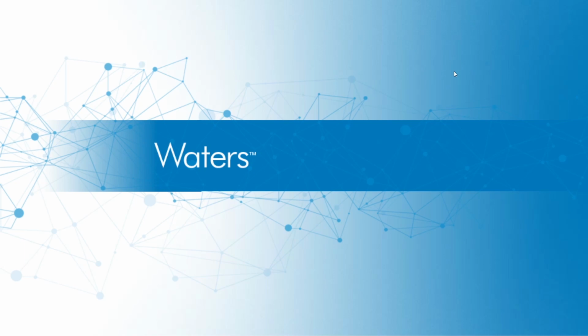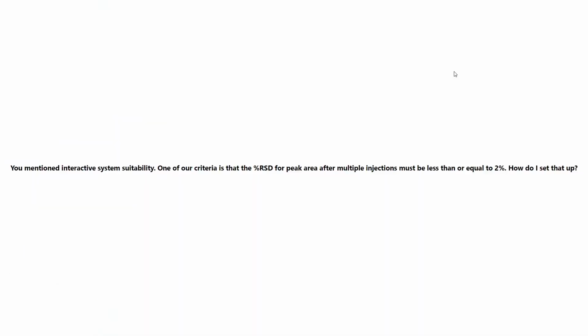So we'll start with the first question, and I will push it to the slide area so that we could all see it. Yes, okay. So the first question is, Neil, you mentioned interactive system suitability earlier in your talk. One of our criteria is that the percentage RSD for peak area after multiple injections must be less than or equal to 2%. How do I set that up?